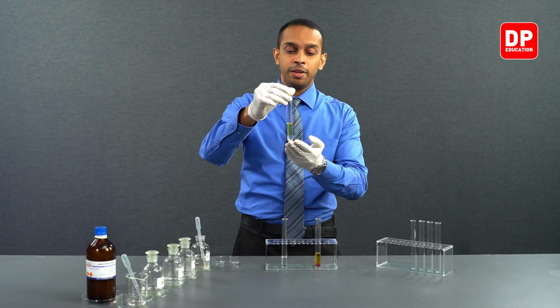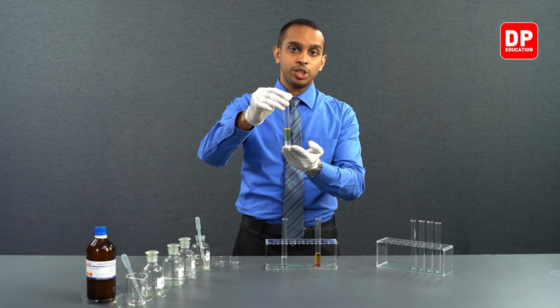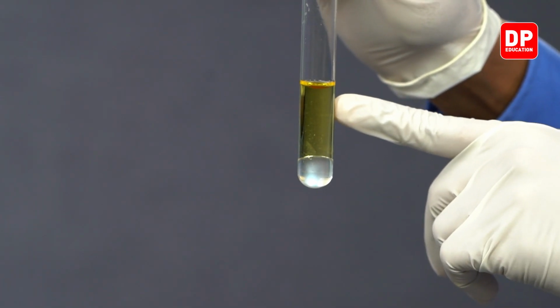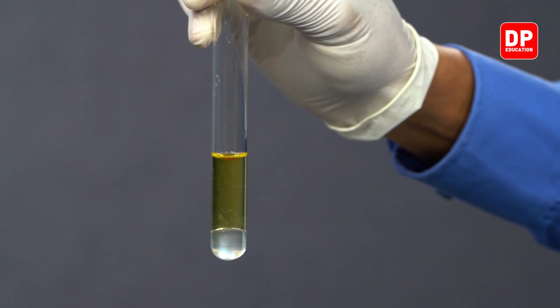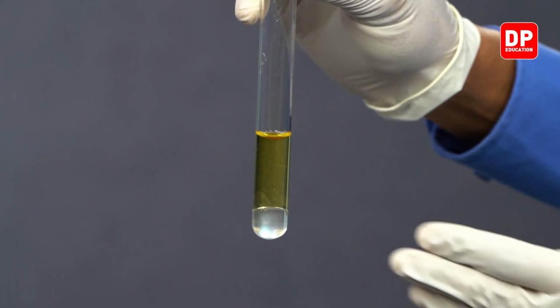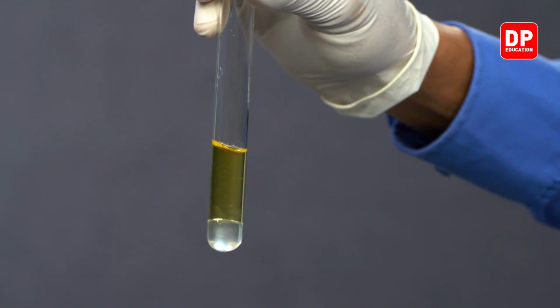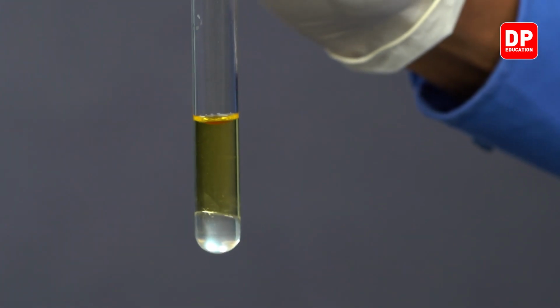And then if you give it a little bit of a shake or swirl, you can see the color will go from the top layer to the bottom layer. Most of the color will transfer there, but the top layer will retain some color, but still we'll give it a shake and see.